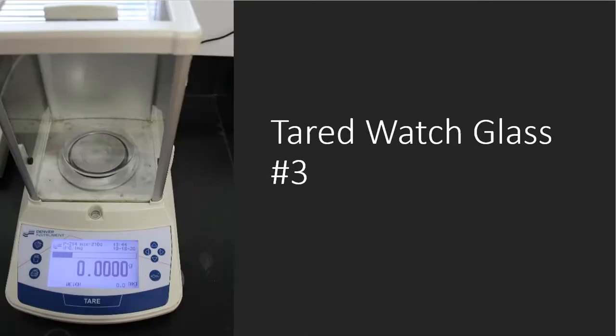And then I do it again for the third time. There's my tared watch glass. And then I take my product and I put it onto the watch glass. And I get 0.3724.